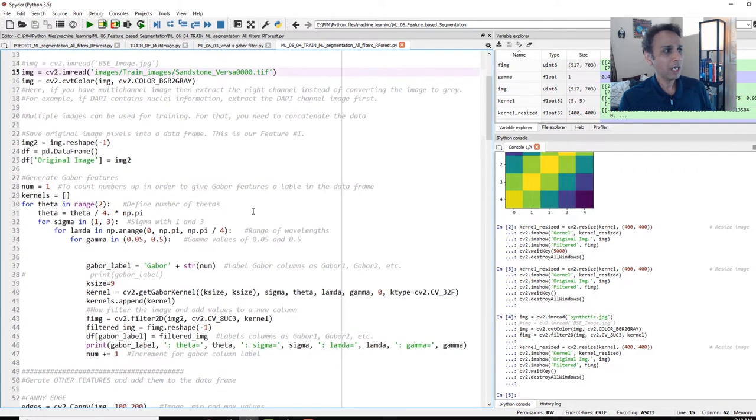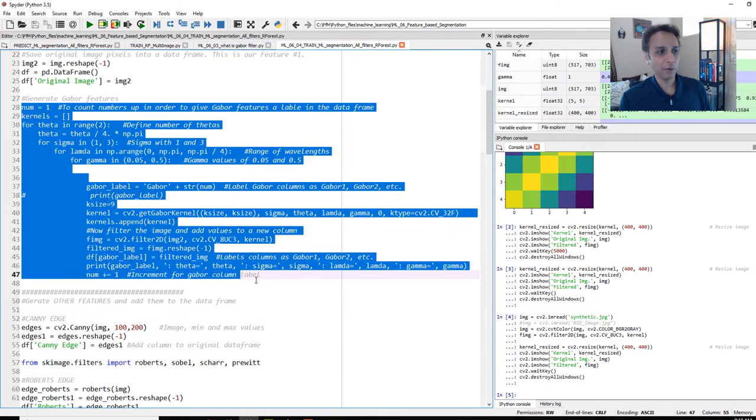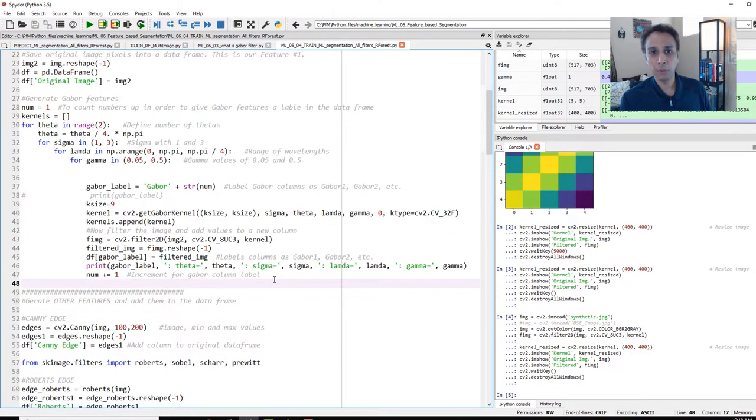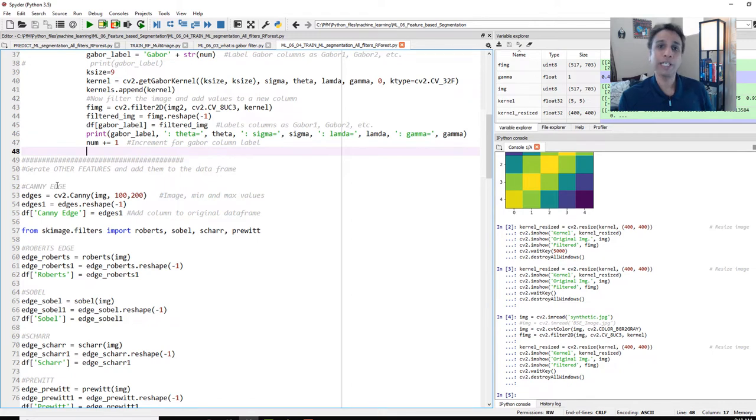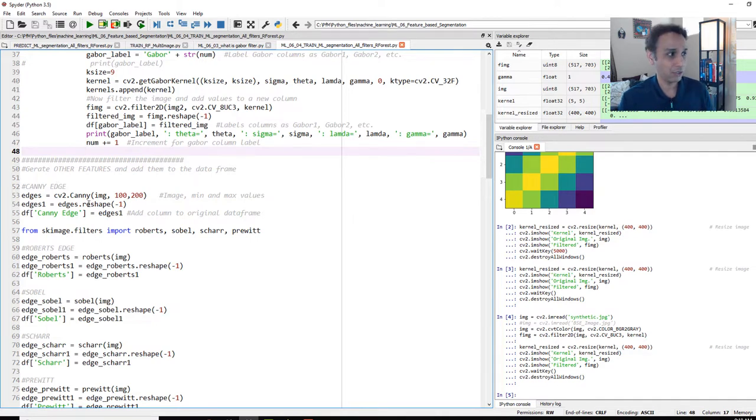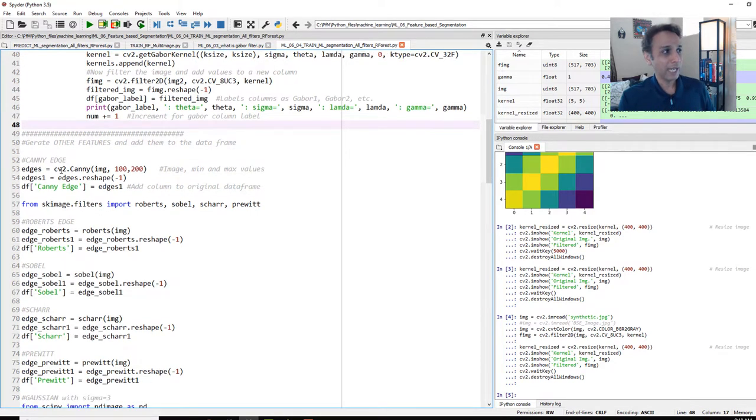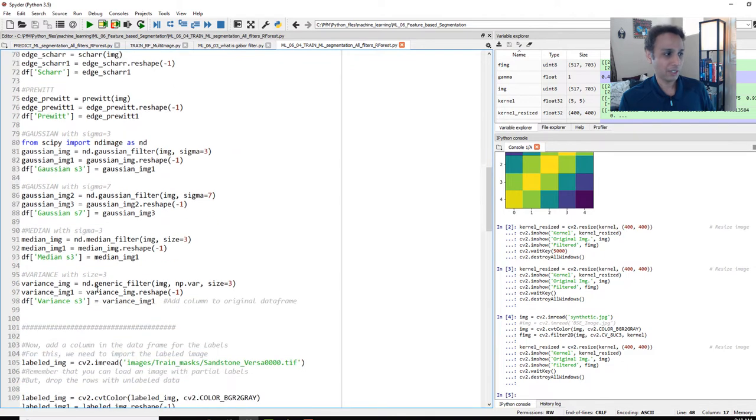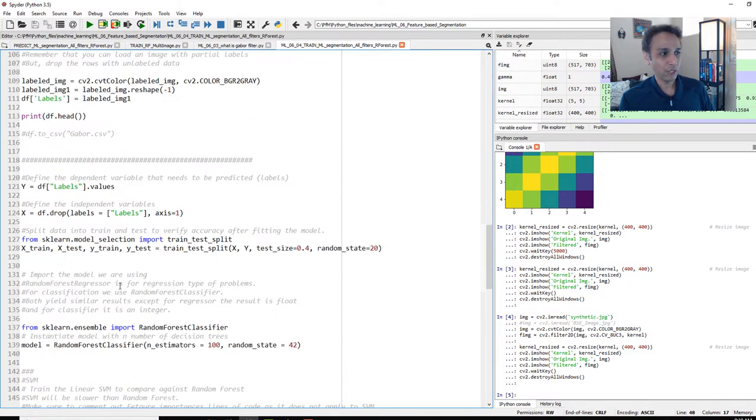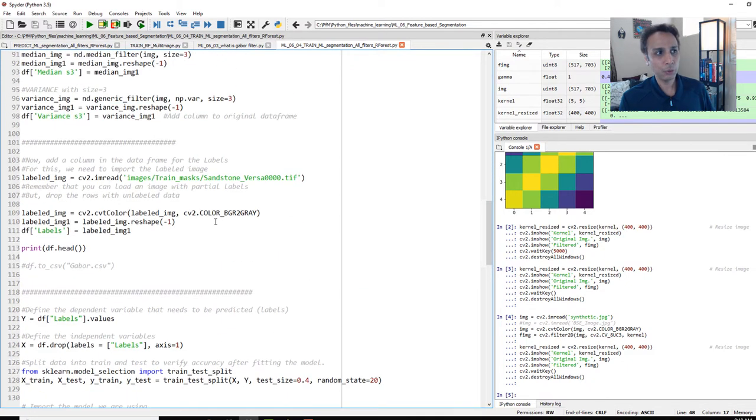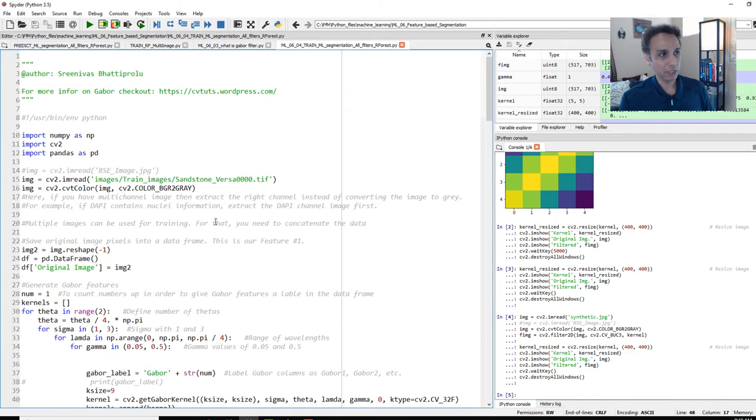And I generated Gabor features, a whole bunch of Gabor features. Watch my video on Gabor to learn more about this. And then we also generated a whole bunch of other features. When I say generated features, we applied filters onto the original image to extract the responses. And that's what we are calling features. So Canny Edge, Robert, Sobel, and a whole bunch of other features. And finally, we used Random Forest.